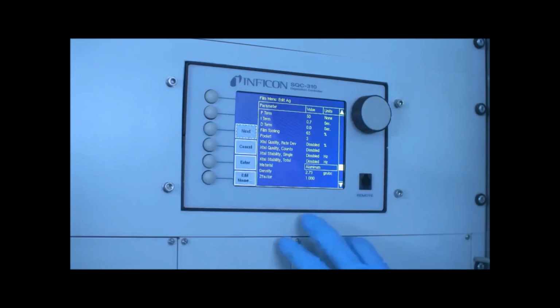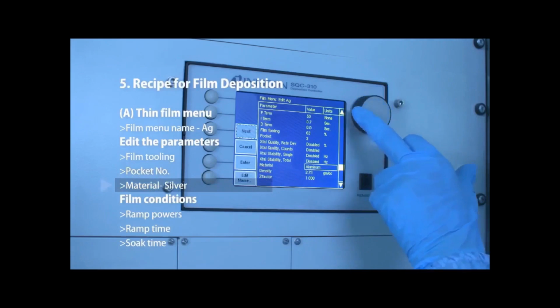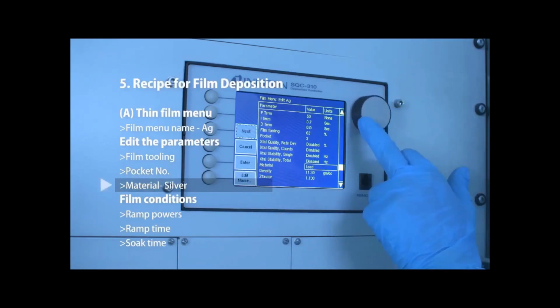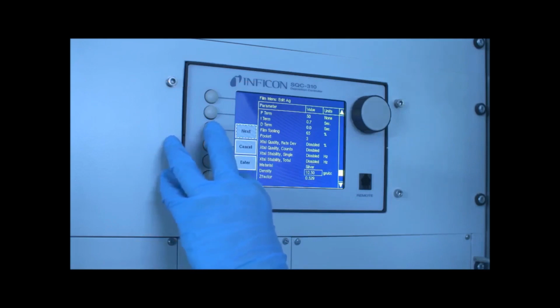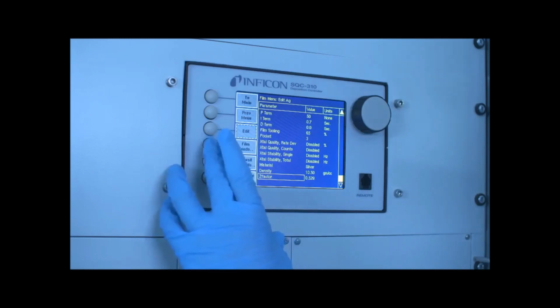Then we have to select the material which we want to deposit: silver. Here, as you see, the density and Z factor have automatically been taken from the database. Other factors we don't need to change. Next part is our film conditions.